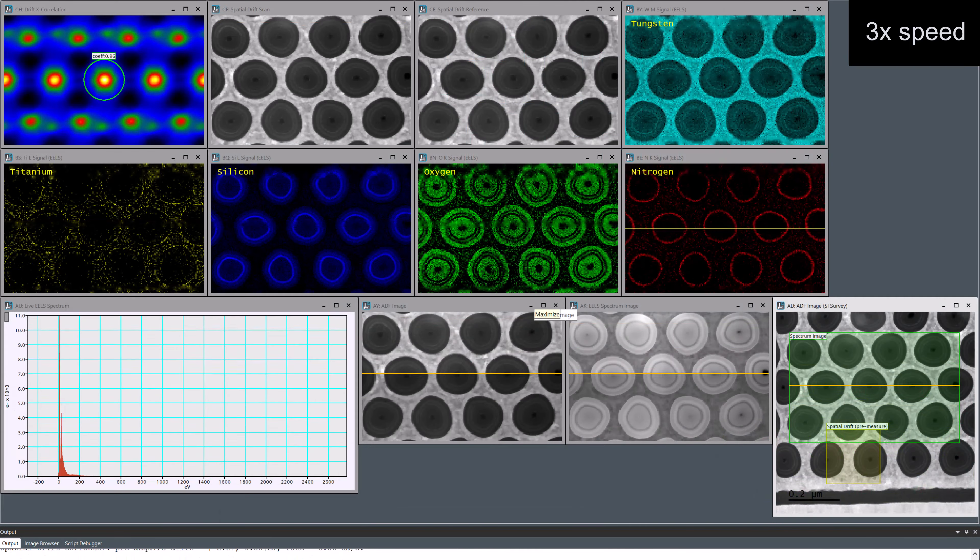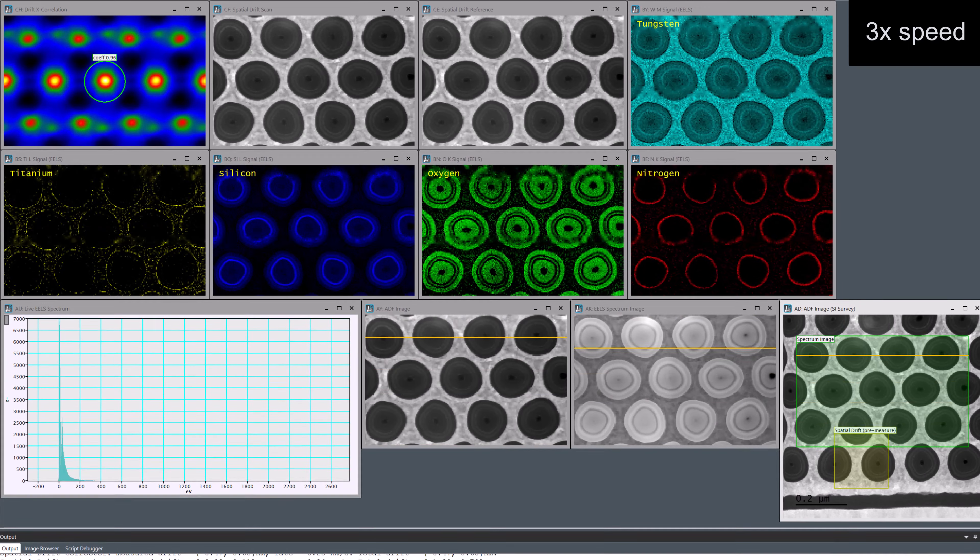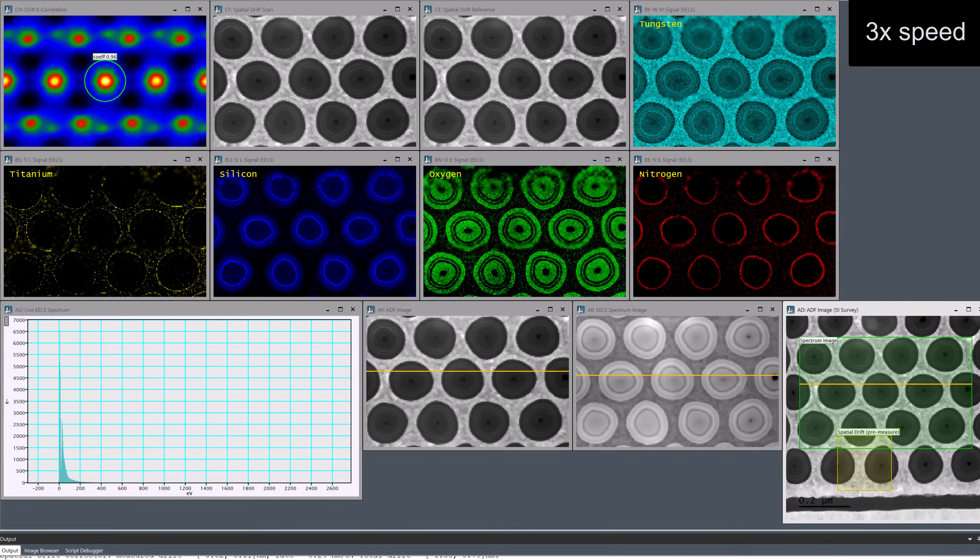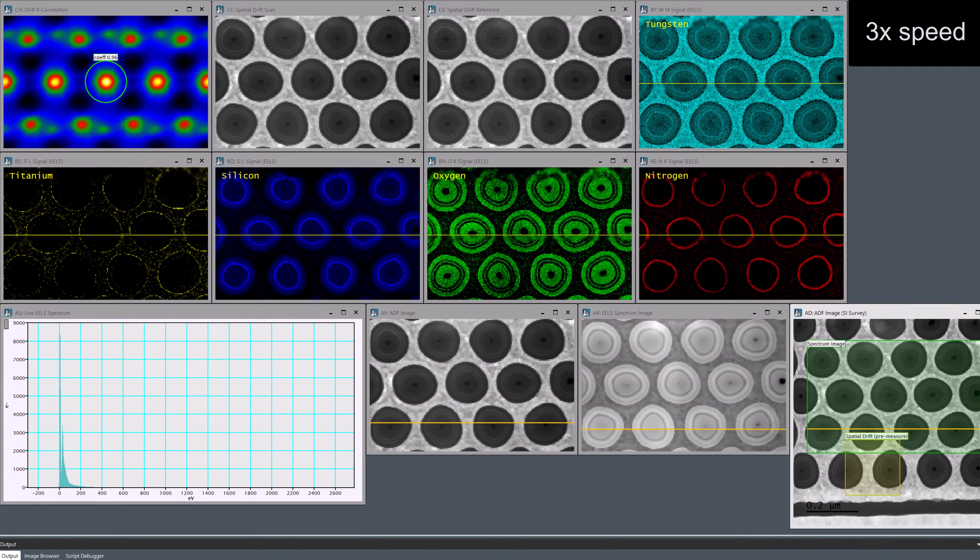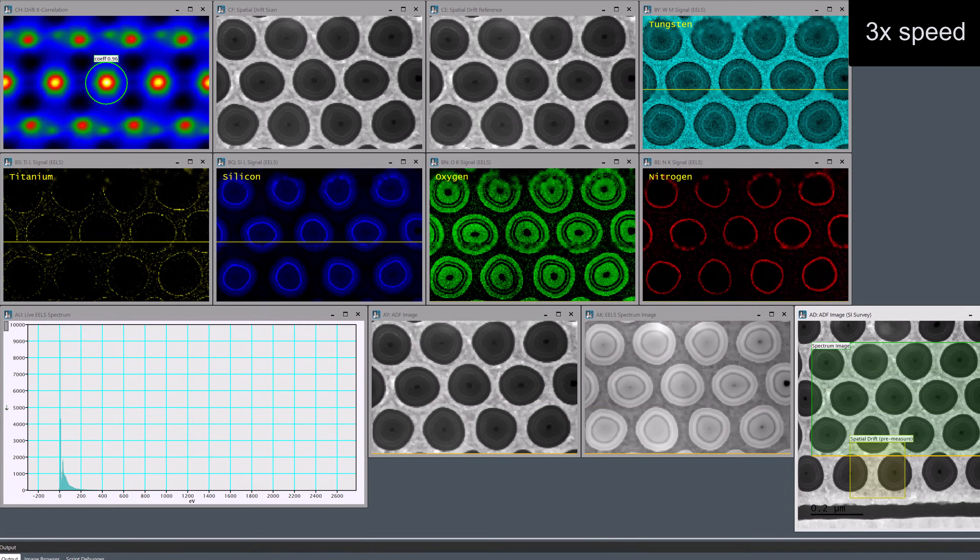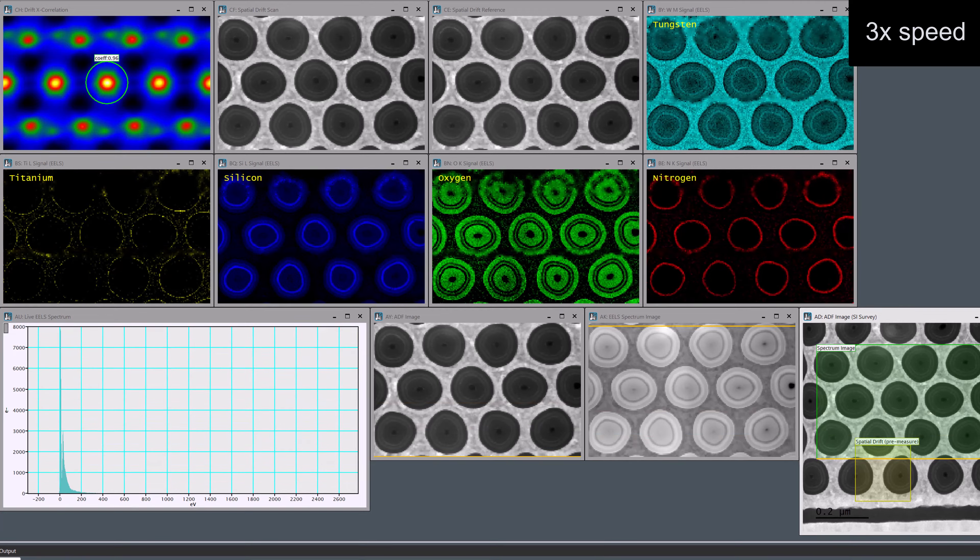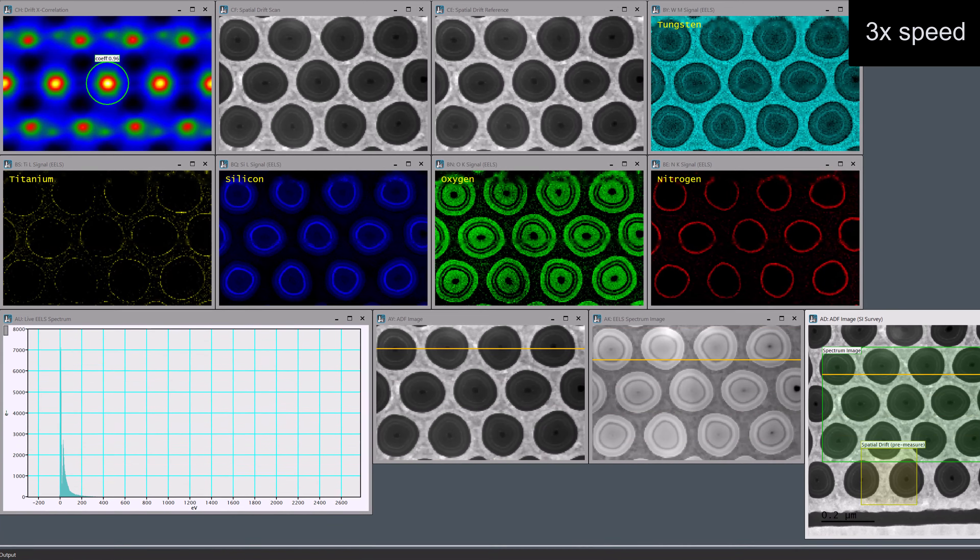The drift correction is being performed after every pass. This is happening with no pause to the scan, so we're really getting our data here with zero dead time.